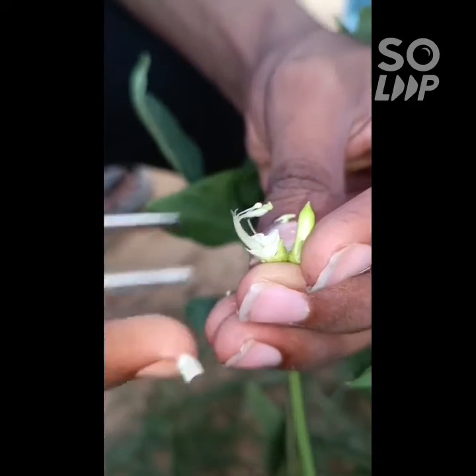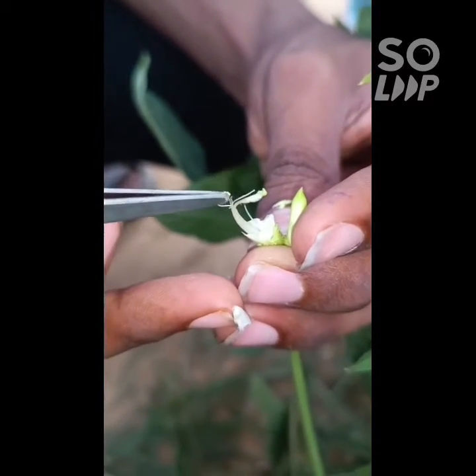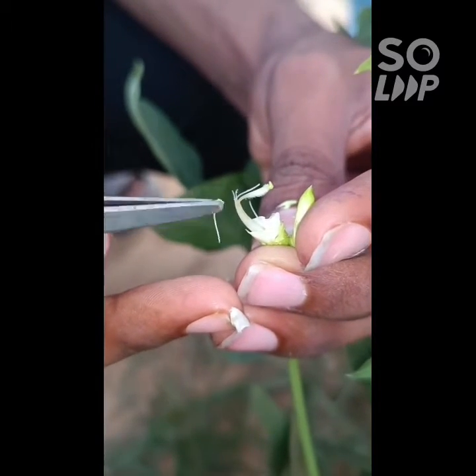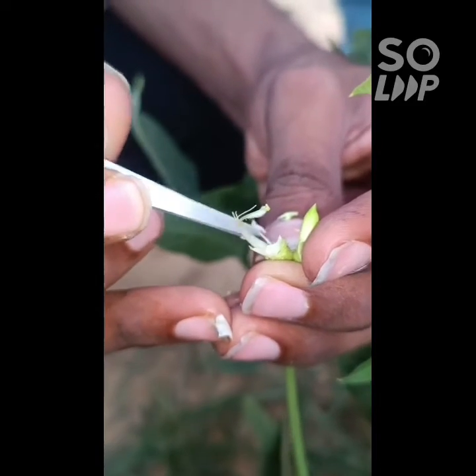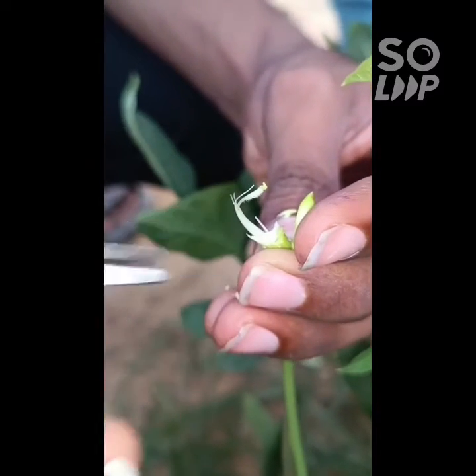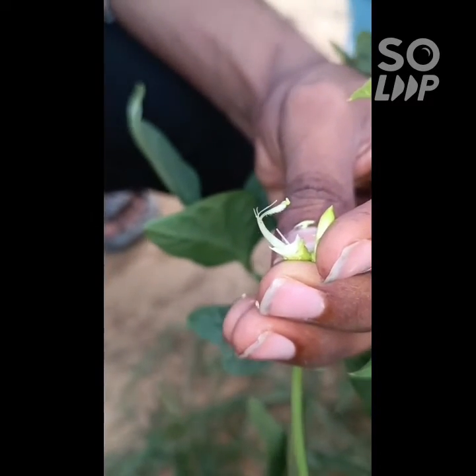After removing the male part of the flower, we will do bagging of the flower. The next morning we will come and do dusting with the desired male parent and then do bagging and tagging.